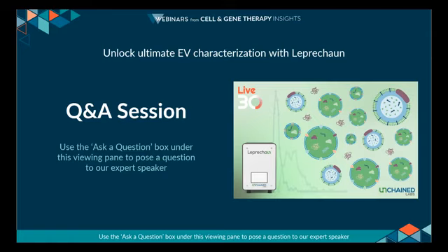Great. Our next audience member says, you talked about customizing the capture and detection antibodies to look for your own markers. How many custom markers is it possible to analyze per sample?